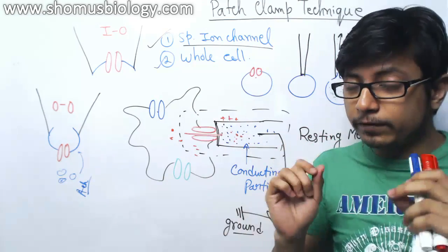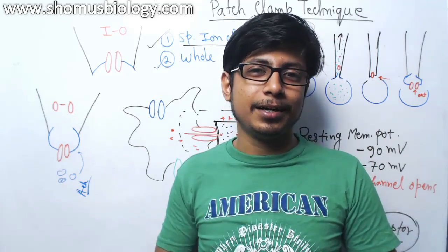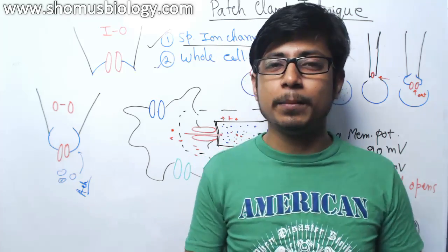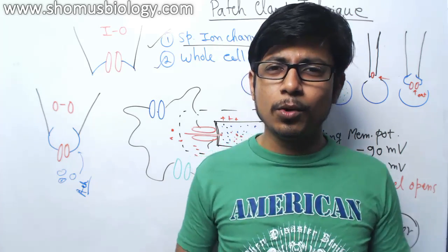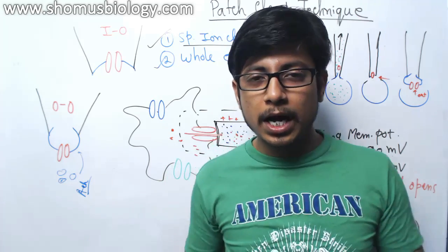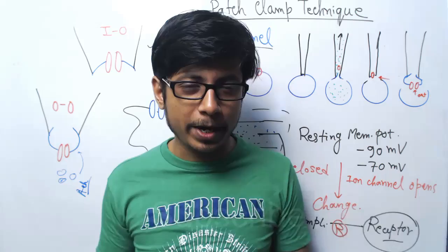That's why this is a very important technique, though delicate, and it requires a huge amount of professional skill to handle, and it is also expensive, but still a very important technique in the field of neuroscience and neural biology. And the more we go on, the more this technique will be needed and developed. So I hope I am able to explain patch clamp in an overall basic way.